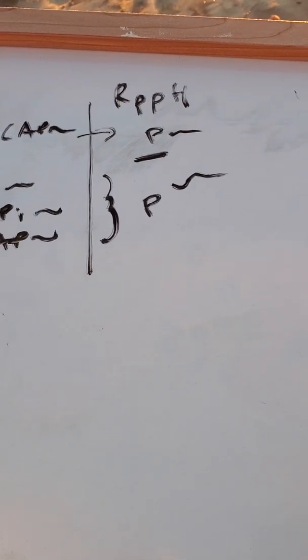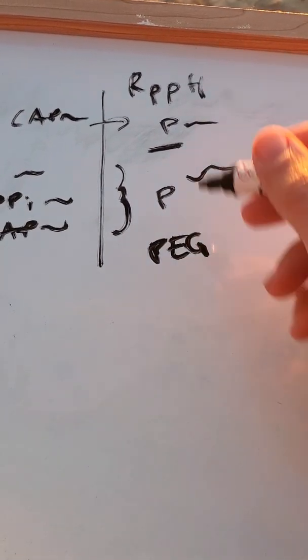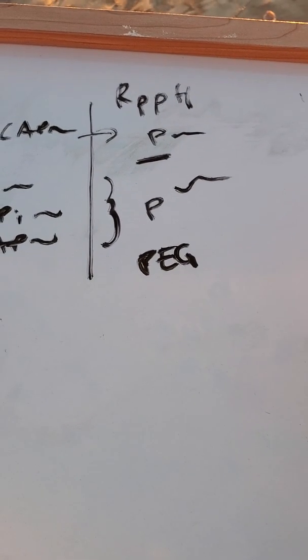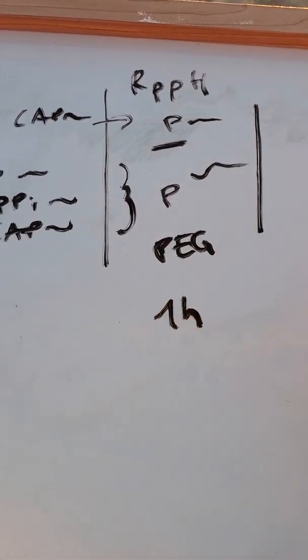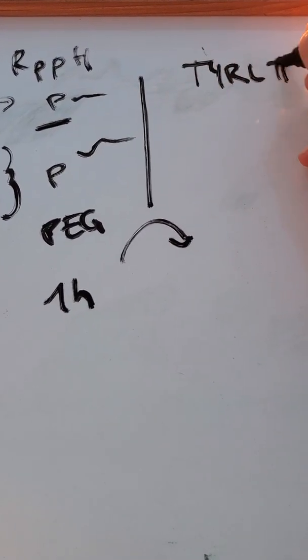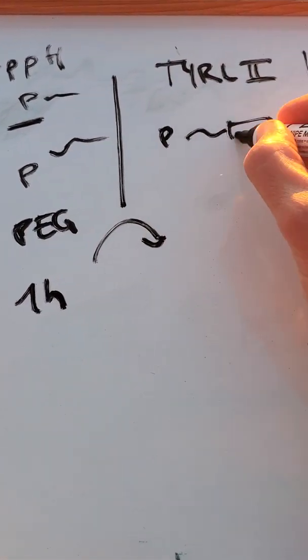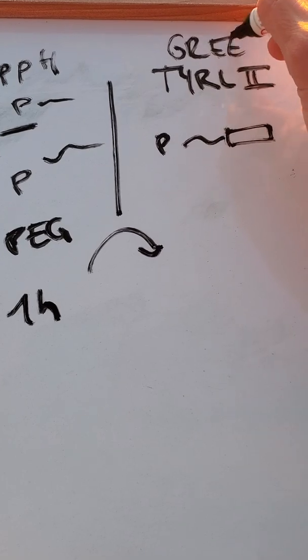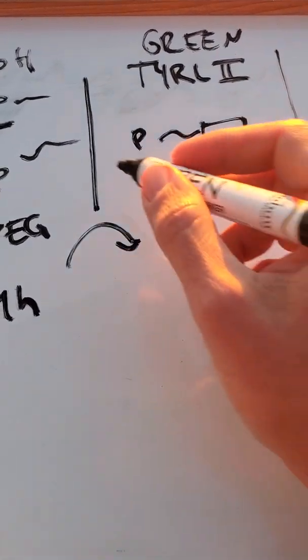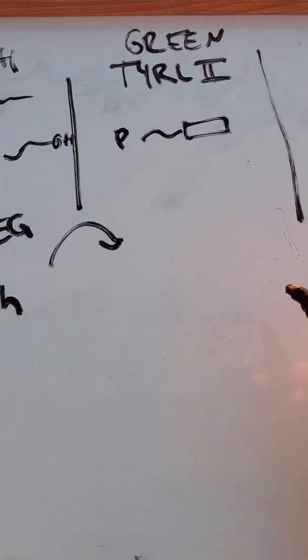The most tricky thing tomorrow about this will be that we're going to add a ton of PEG in here. PEG is a crowder, and the reason we add it is so we increase the concentration during the 3' adapter ligation, thereby increasing its efficiency. So this will take us an hour, and then on top of that we add the next master mix, which is basically the T4 RNA ligase 2, the truncated version of that. So now that we have the 5' phosphate, we're going to ligate on the adapter. The reaction that is catalyzed here, and this will be sort of the green tube tomorrow, is the 3' adapter ligation, which takes the 3' OH with the adenylated adapter to add the 3' adapter.